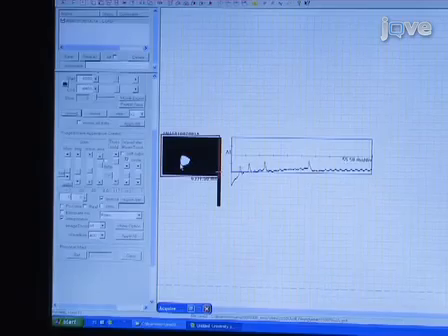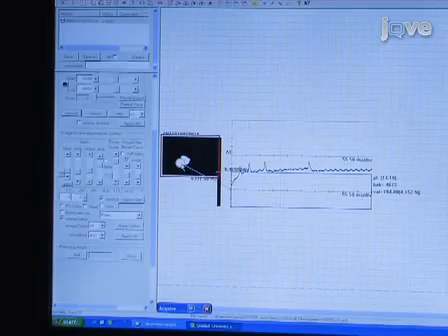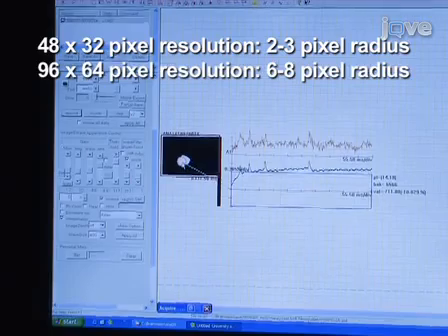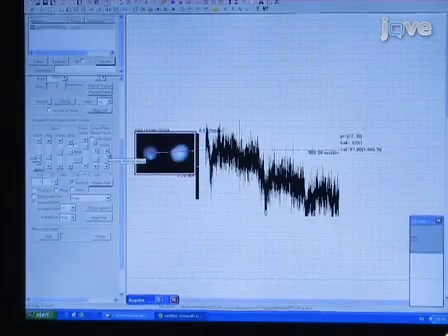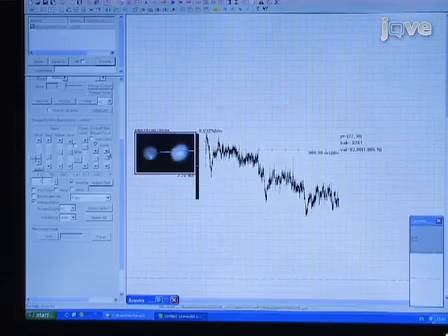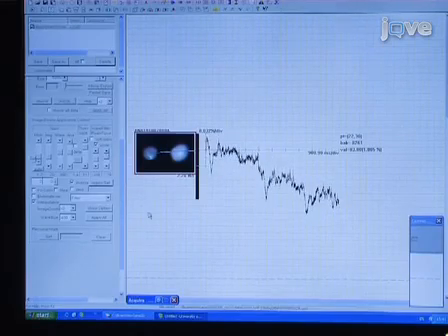To begin analysis of the optical responses using the BV-ANA imaging software, select an appropriate circular region on each recorded neuron. If temporal smoothing of the data is necessary, for example, if the dye generates a relatively low amount of fluorescence, use the software to apply temporal smoothing with 3 to 5 time units.